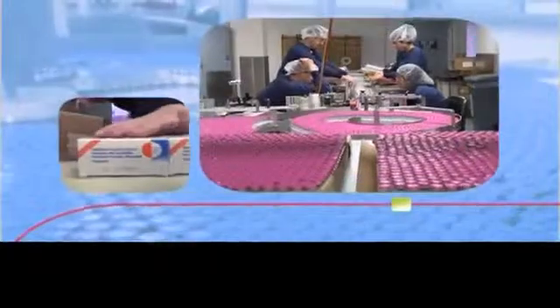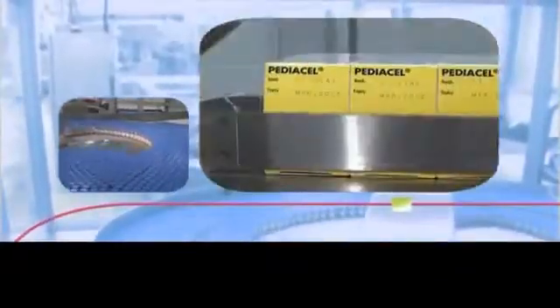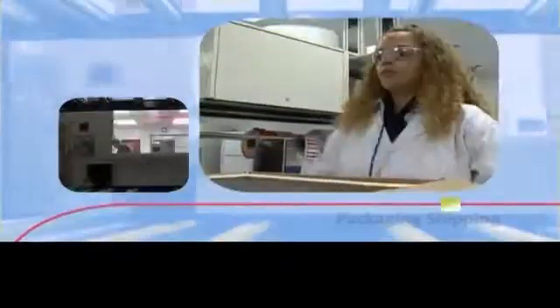Once again, certain precautions are absolutely necessary. From the moment the syringes and vials are filled, up to the time the vaccines are administered to patients, maintaining the cold chain is of the utmost importance. Vaccines are fragile biological products, and their potency can be lost if they're exposed to light or to temperatures that are too warm or too cold. To guarantee that vaccines will offer protection against disease, they must be stored at a constant temperature, between 2 degrees Celsius and 8 degrees Celsius.